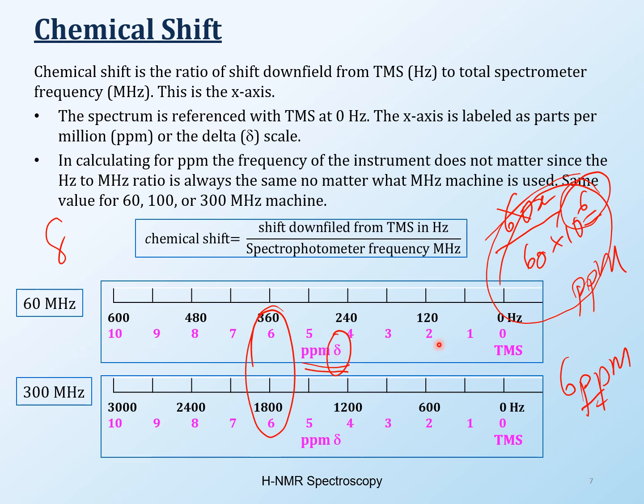There are some other things that you need to understand about chemical shift, and as we go on, we'll talk about that. Remember the referencing compound I talked about, TMS, that's going to be at 0. That's the rightmost signal. So when you're processing your NMR data, the first thing you do is set your chemical shift scale, you're setting your reference point. Now we all have the same kind of scale, so whatever instrument you have, that's chemical shift.